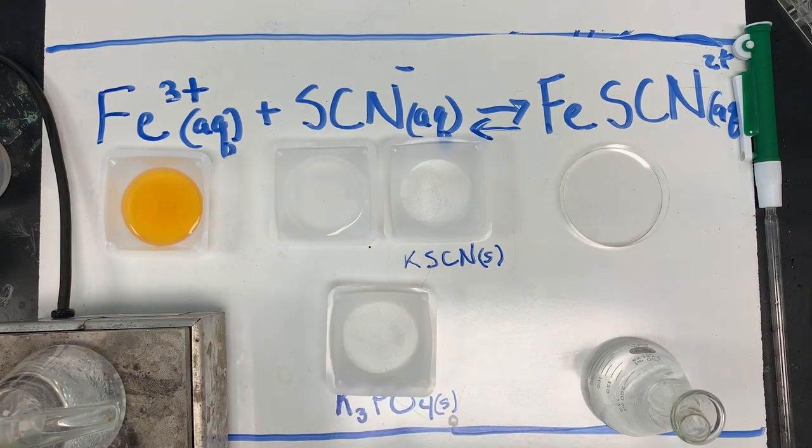In the second dish, I have clear potassium thiocyanate. Potassium acts as a spectator. It's also there with the thiocyanate.